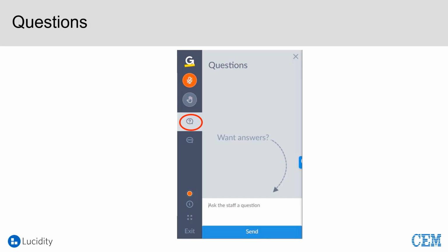That's a great question, and we saw a little bit of that data today: you'll probably see the whole chromatogram shift. If you do what I suggested and just take the new carrier gas, it's not a bad place to start. Run whatever conditions you already have and just switch one variable at a time. So change, let's say, from helium to nitrogen, which were the slides that I showed.